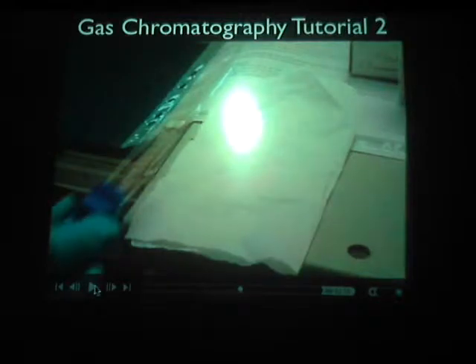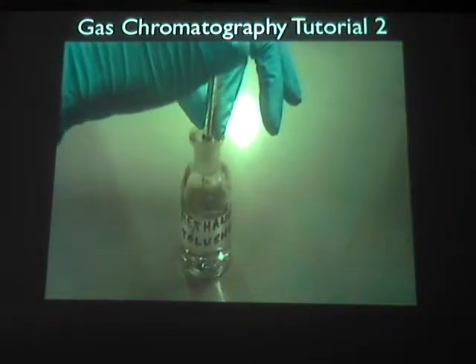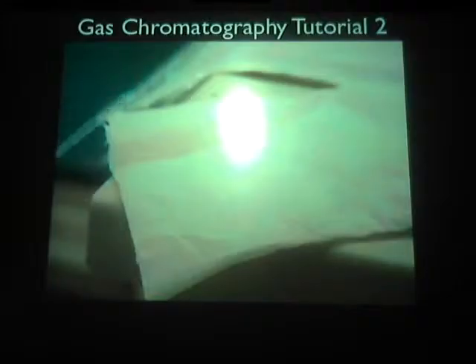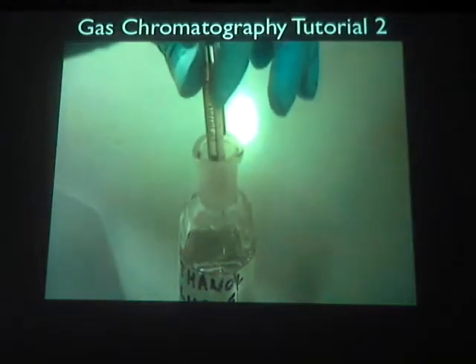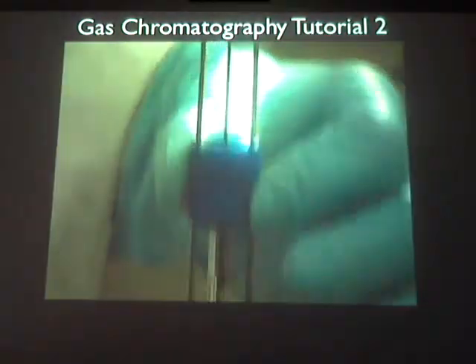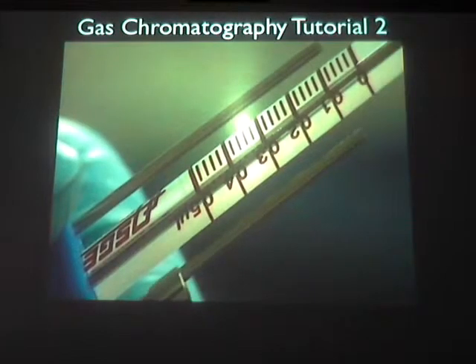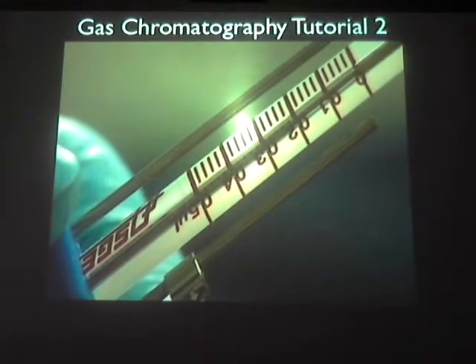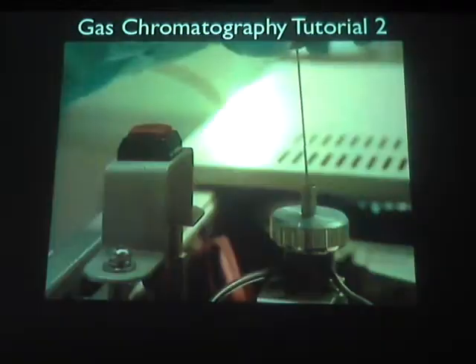Now, look at this mixture she has here. Look at the bottle. See what it says on it? Methanol and toluene. About 0.1 microliters is taken up in a hypodermic syringe. Look how thin the syringe is. It's tiny. 0.1 microliter. It is then injected into the small inlet port through a self-sealing rubber disc called a septum.